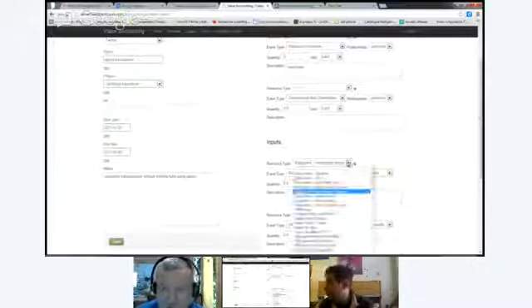It's in time, I guess, time contribution. No, it's not. The time contribution is like work. This would be just resource consumption. So okay. And you're going to probably use it. It's probably the relationship. Okay. Yeah. So I think we need to put more data into the system for these resource types or equipment, more equipment and tools.